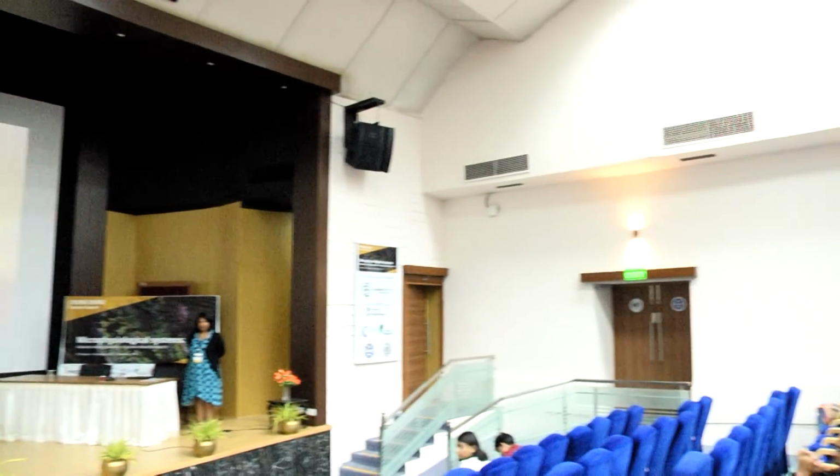Hello. Yeah, thank you, Dr. Maria. It was a wonderful talk. So, my question is that if we mix 2 or 3 components like hydrogel or collagen, and then we cross-link them in the device, because we have been facing some issue that it is not sufficiently creating a hindrance or a blocking for us if we are using even a combination of such gels. So, if we cross-link them, will that help, or would it provide a better stiffness for the gels which we are using if we mix and cross-link those materials?